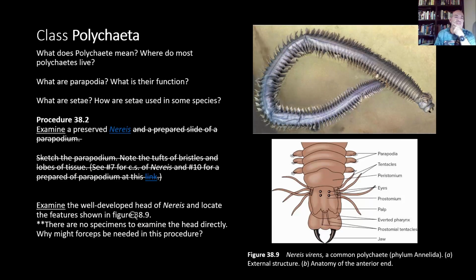Looking at the first group, the Polychaeta, the first thing you notice is the very pronounced structures along the lateral sides of this animal. You can see the segments, but they have very pronounced and very many bristles, so that's where Polychaeta comes from. Polychaetes are marine, meaning they live in oceans, bays, and salt water.